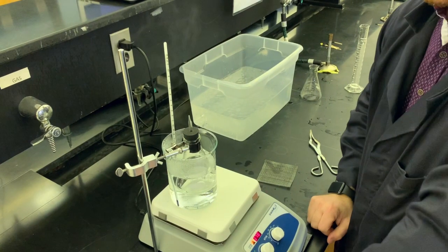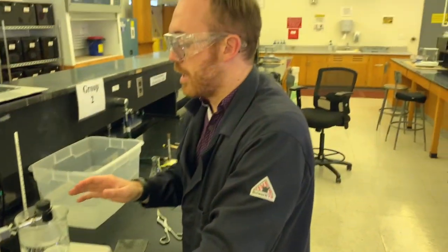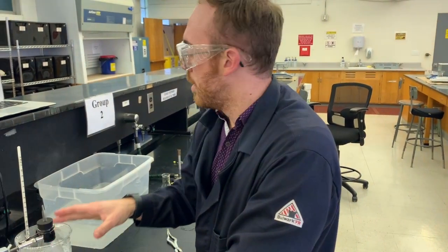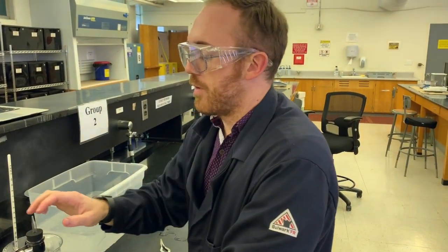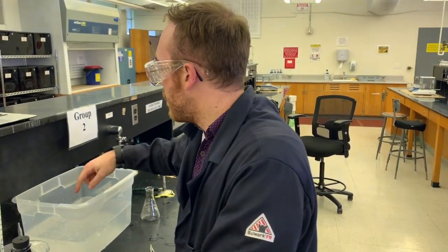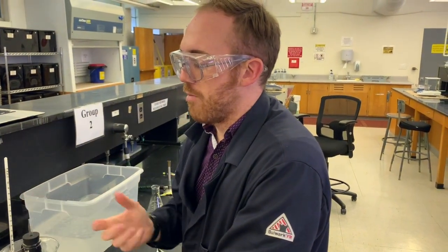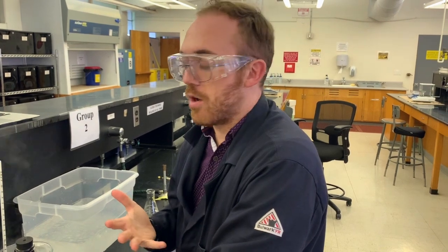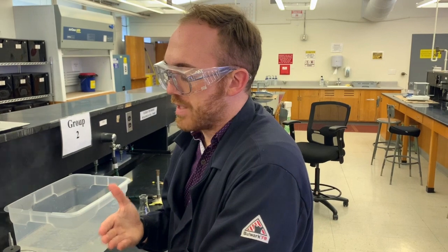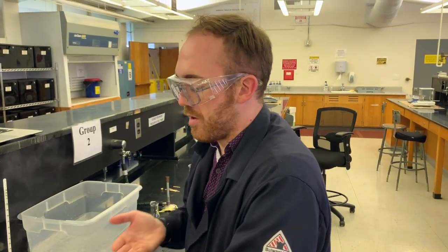If you're mostly worried about messing up, the usual issue you'd be expecting is holding the flask for a long time in the air, moving from the hot water to the ice bath. But if you cover the tip with your finger, which you should anyways, just in order to make sure that you actually get a good seal under the water, that's going to be pretty avoidable for the most part. And as long as you take the careful amount of time to allow it to cool, you're going to see that water get drawn into the flask.